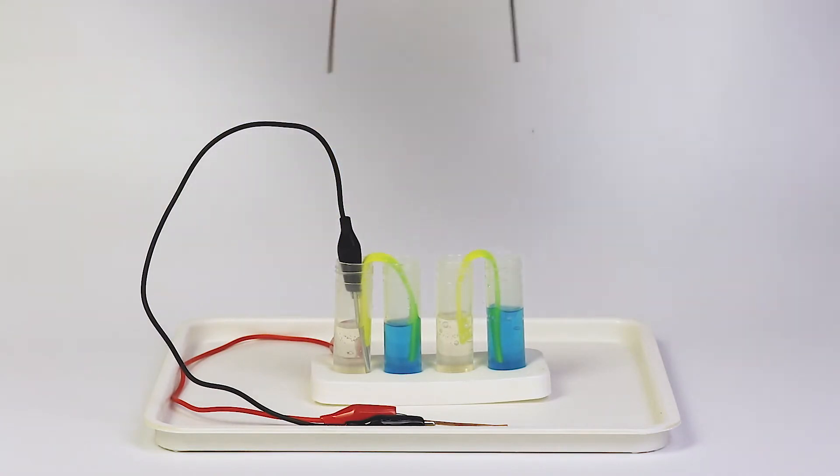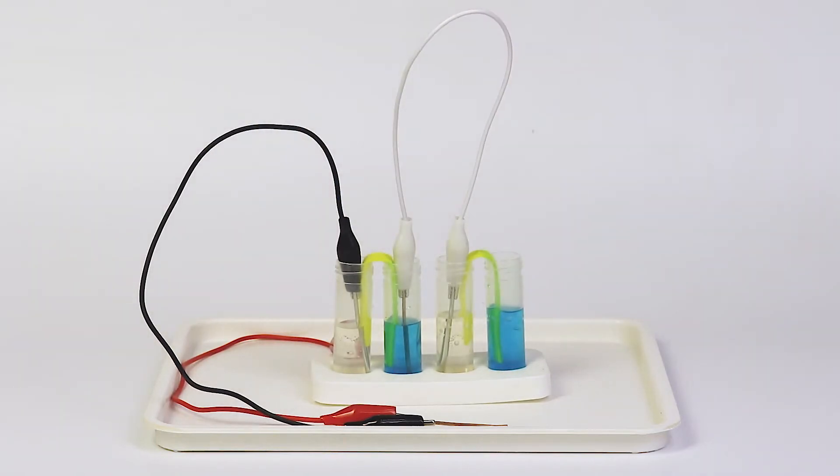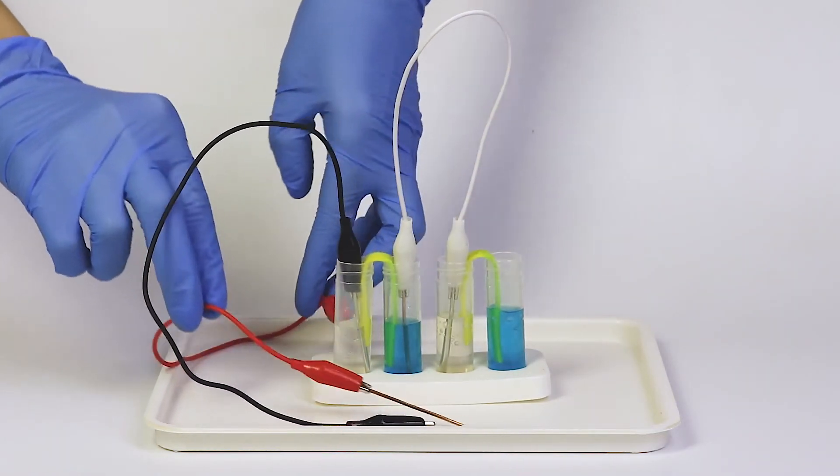copper into the second vial, and zinc into the third. Finally, insert the copper piece on the red wire into the fourth vial.